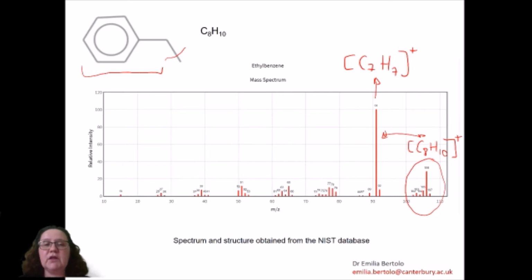the structure of the fragment, because there might be chemical changes that happen inside the spectrometer that we have no control over. So my suggestion would be that you do not suggest the structure of the ion unless you have been asked to, but simply to what mass it corresponds, in a similar way to what I've done here.